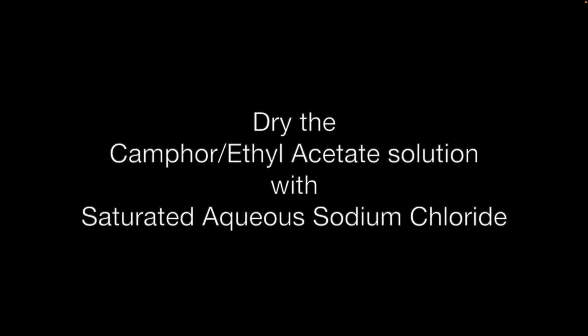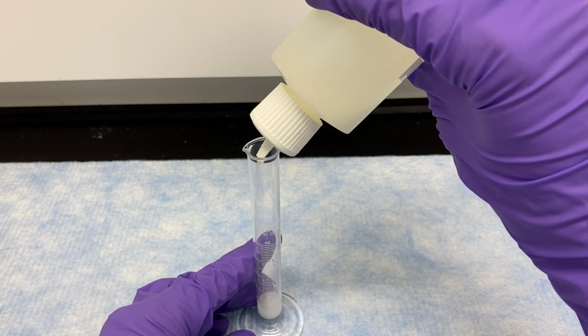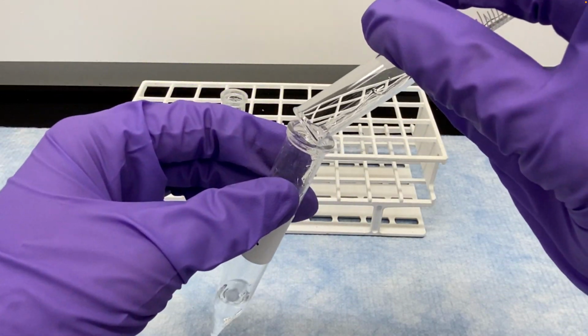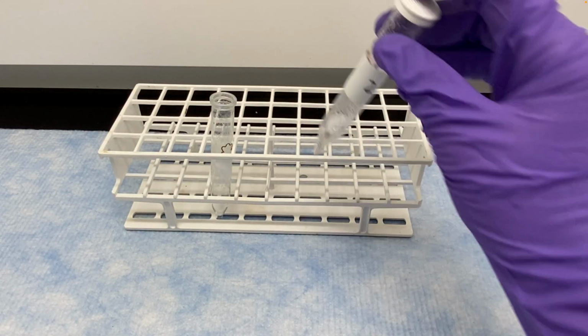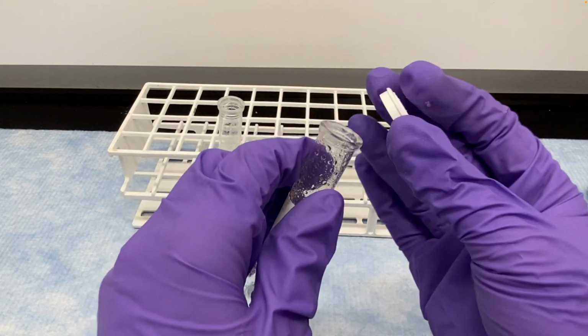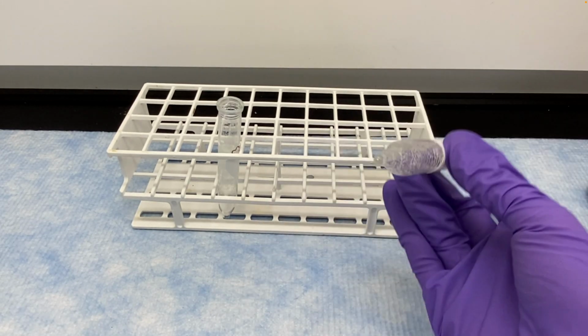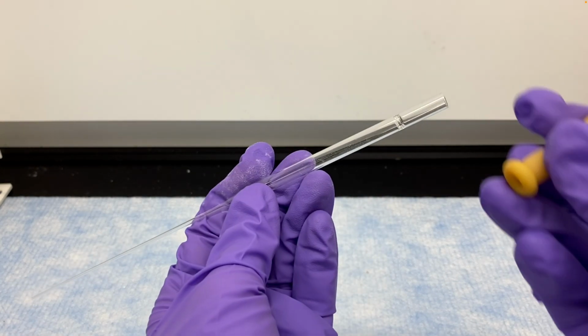So we're going to use that idea to dry the solution, because when we shake this really, really salty solution up, all the water is going to go towards it. Water follows salt. So we'll pour this salty solution in, and any water that was left over in your centrifuge tube is going to go towards the salt and separate into that separate layer, which will be the bottom layer. So we do another extraction. Notice I vented it after 30 seconds or so, and then we want to separate our now dry camphor ethyl acetate layer, which will be the top layer, from that saturated aqueous sodium chloride water layer on the bottom. We're just going to do that mechanically, just like we've done before.